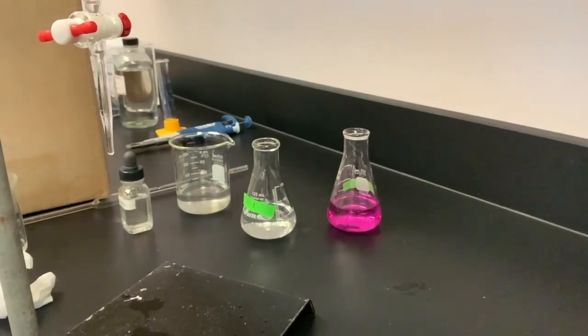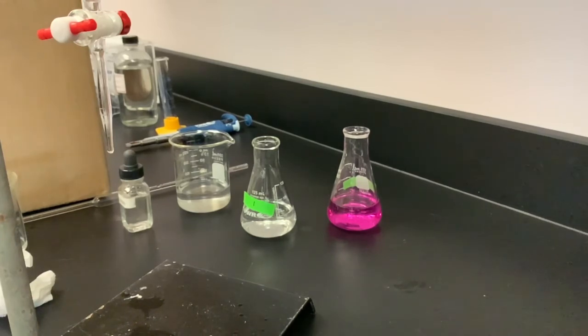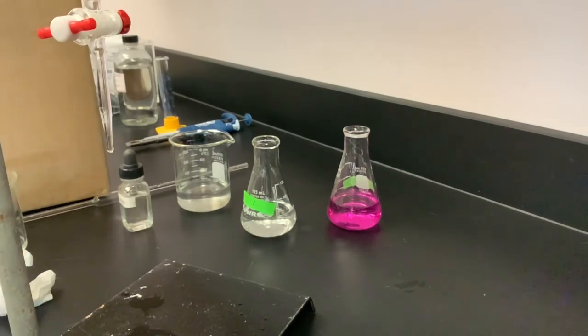So with these measurements, we are going to take the average volume used, and we're going to use that to figure out the sodium hydroxide concentration. So you guys do those calculations on your own, and then in the next part of the experiment, we're going to take that sodium hydroxide and we're going to use it to titrate another material.